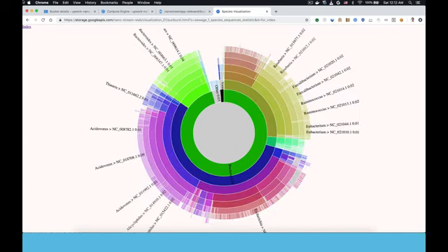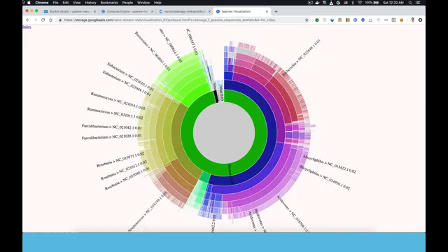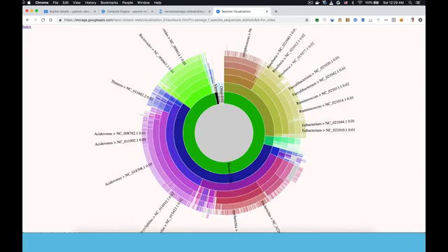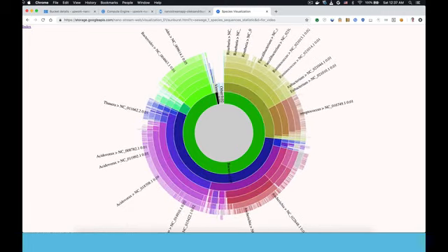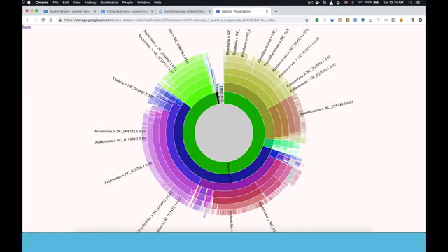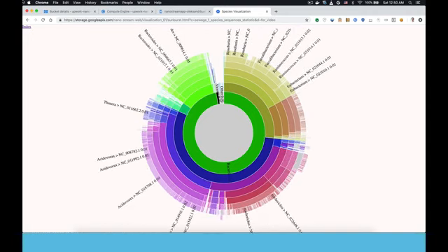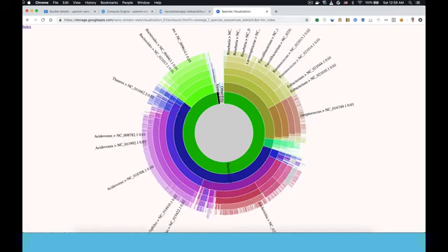And that's it. So it's just going to keep running like this for some time. In this case, we're just doing a survey of what's present in this sewage sample. In other cases where the application user would want to be making a particular decision, they might be looking for the presence or absence of a virus or trying to determine what particular pathogenic bacteria is present in a sample, etc.